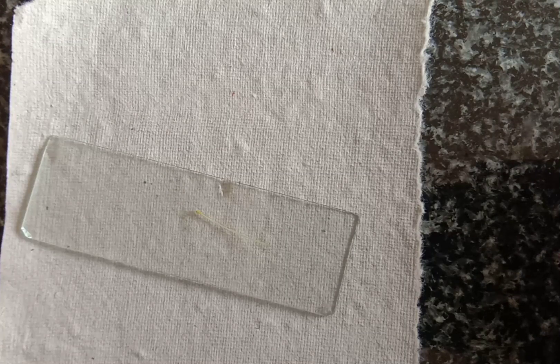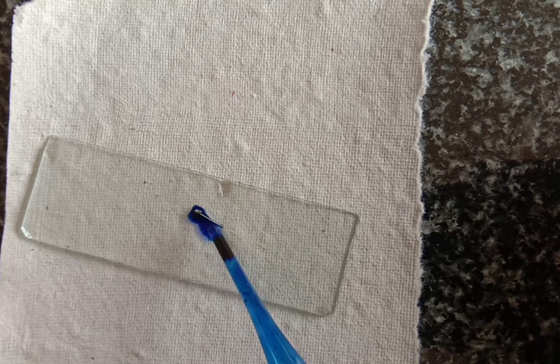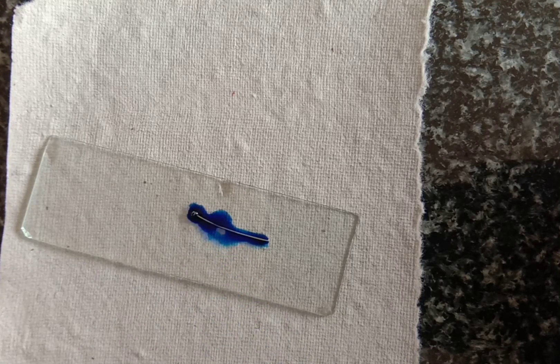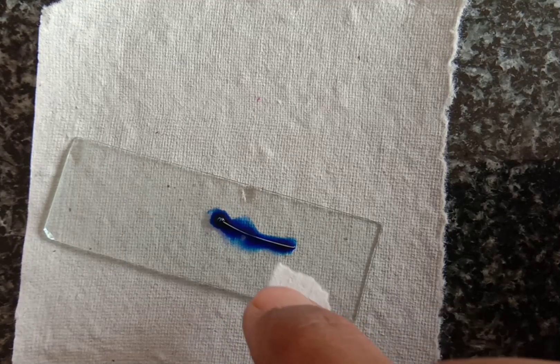Now add one to two drops of methylene blue or cotton blue stain on that with the help of a dropper. To remove the excess stain, you can wash it with water or use the blotting paper like this — using blotting paper you can remove the excess stain.